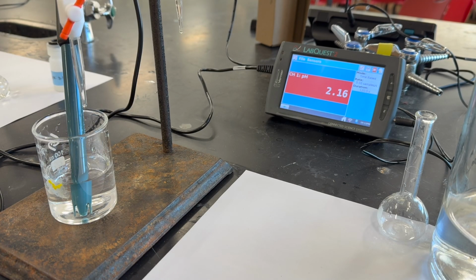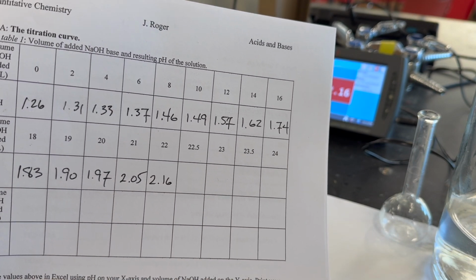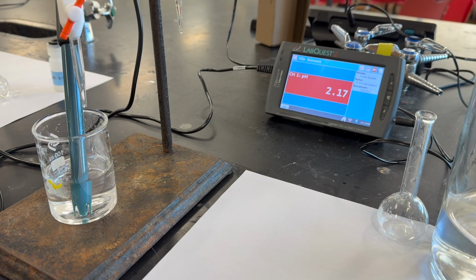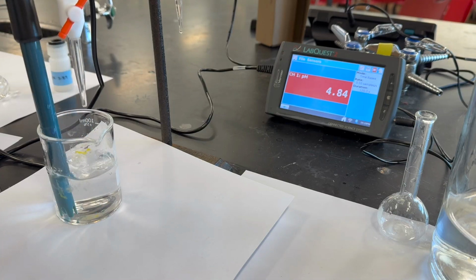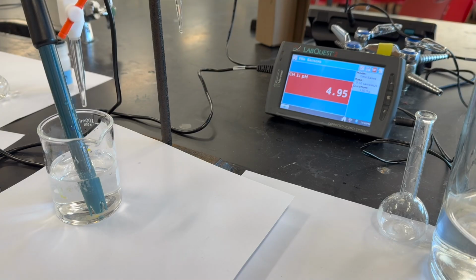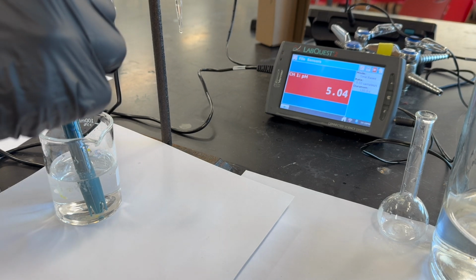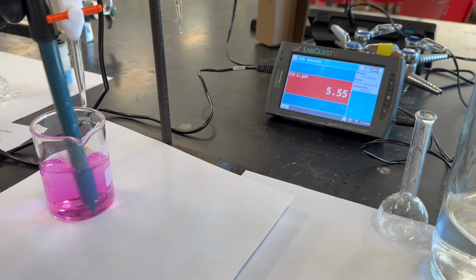All right, we have now added all of our 1 milliliter increments. So we are now starting the 0.5 milliliter increments. Again, we write the pH every time. And we are getting very close. Still adding half milliliter increments. We should see the pH jump right here.